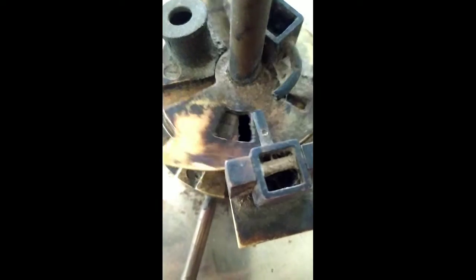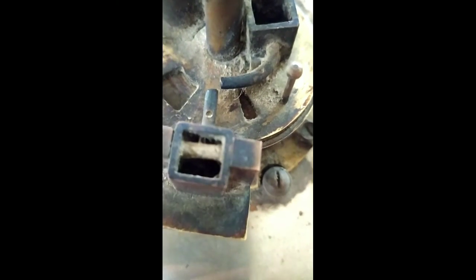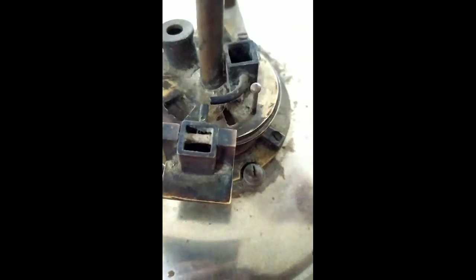This is the shutter, and it works on a lever mechanism. When we move this shutter, you can see 2 openings open here. One is for air, this is in closed condition, this is in open condition. This opening is for air, and this opening is for the test flame. The test flame is introduced to the vapors of oil, and this is the bend tube. This is the pilot burner, and it comes in contact with the test flame to relight it. So this is the working of the Pensky Marten apparatus.